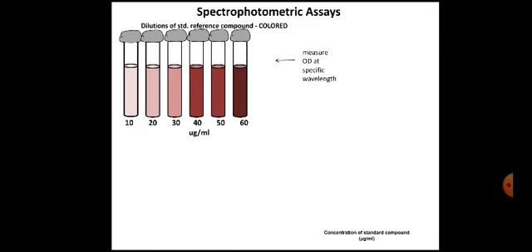I have already explained how to select it: the wavelength of light which is maximally absorbed by the desirable standard reference compound should be selected as the specific wavelength.